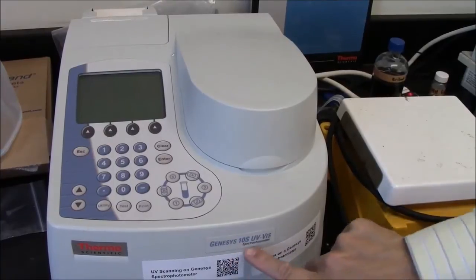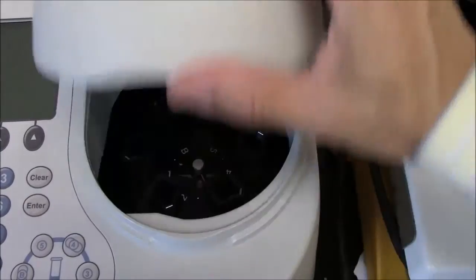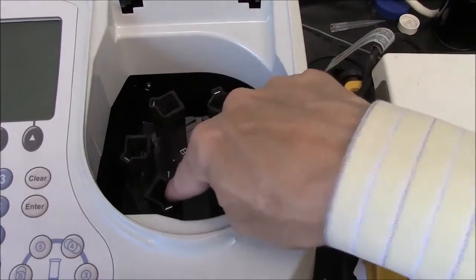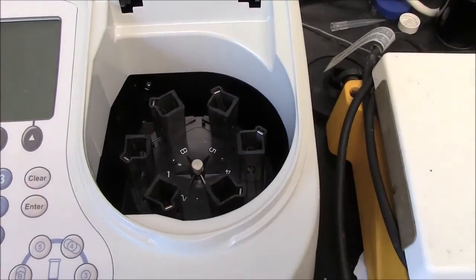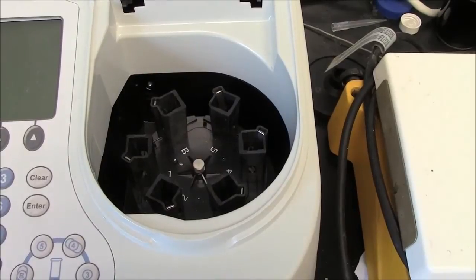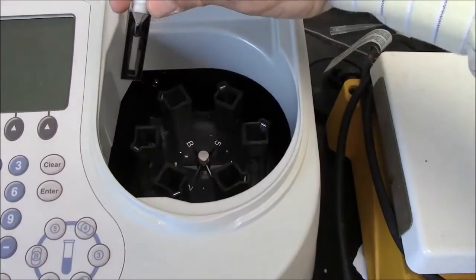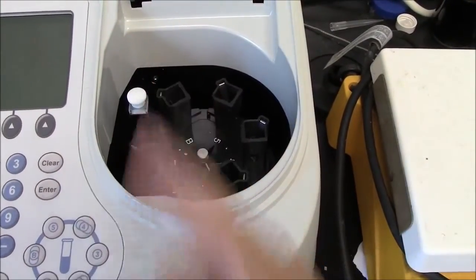This is an actual spectrophotometer, a Genesis 10S. Inside this compartment is a contraption that can hold six cells, six cuvettes. Typically, you will only have one cuvette, so this is not necessarily useful for you as a beginner. You have to align the clear faces so that a light beam passing in this direction would go through the clear faces.